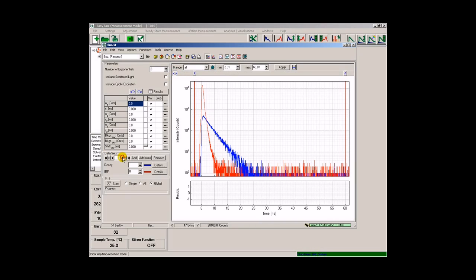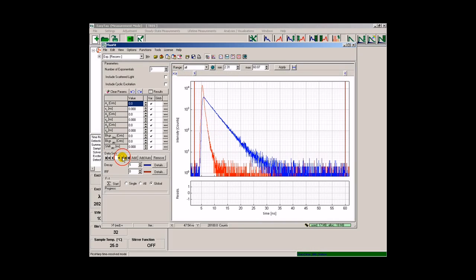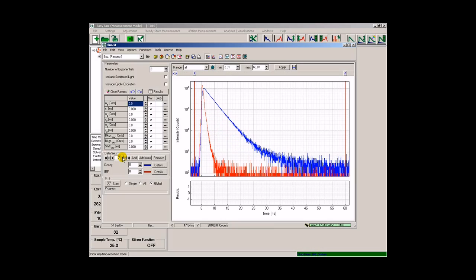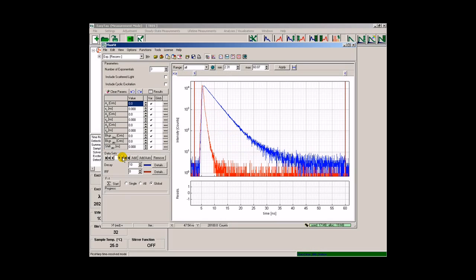We can use the dataset controls to browse through the individual decay histograms contained in the dataset. Selecting the proper start parameter speeds up the fitting process. Therefore, I will select the three expected fluorescence lifetimes.